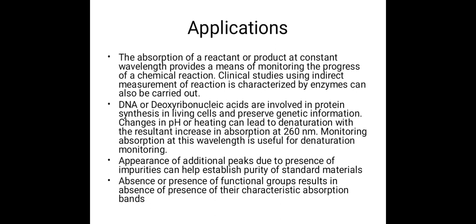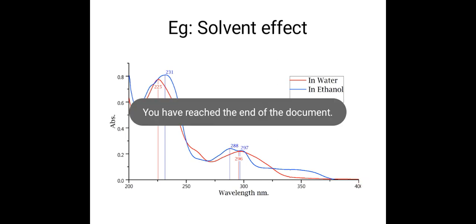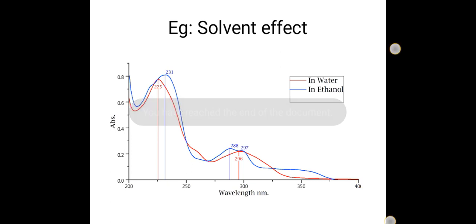The versatility of UV visible spectroscopy has been adapted to detection in the UV HPLC technique. It is a particularly useful detection mode in HPLC for organic molecules. The simplicity, accuracy, and cost effectiveness contribute to its popularity in areas such as pharmaceuticals, life science, foods, environmental studies, forensics, and mineralogy. Solvent effect in water and in ethanol, wavelength, absorbance, etc.